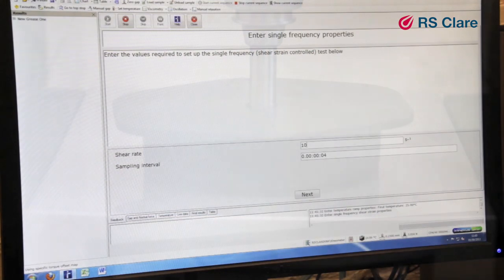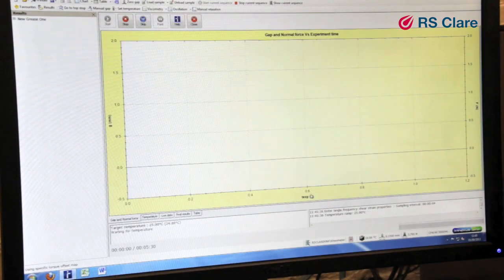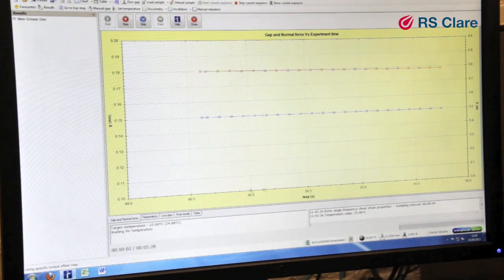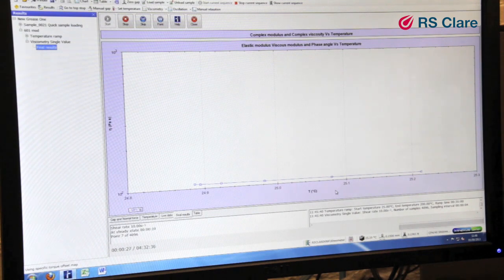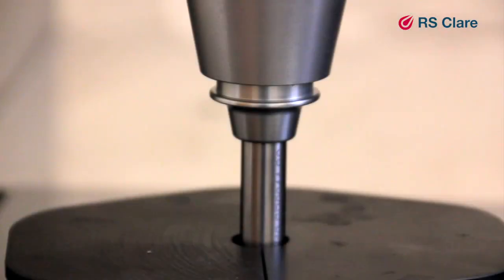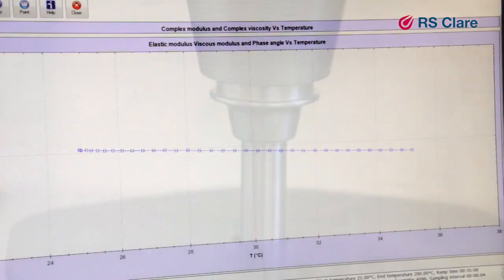The cone can either be rotated or set to oscillate at a known speed. The test parameters are inputted into the computer. The nature of the test allows different aspects of the grease's properties to be studied.